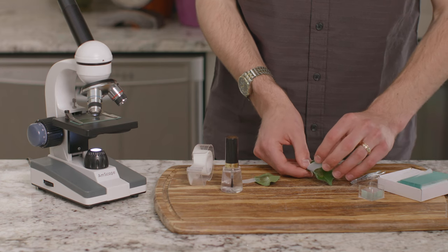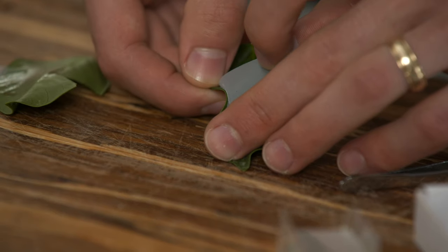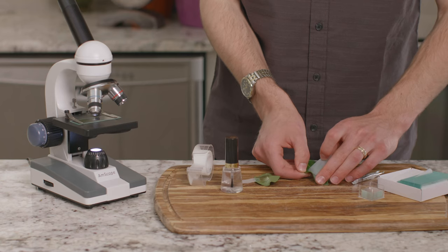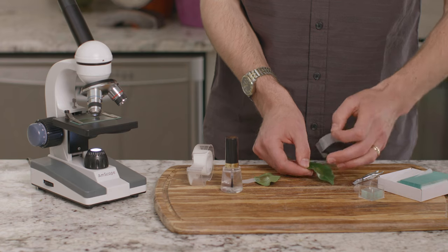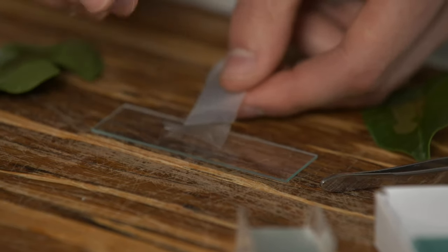Once the nail polish is completely dry, gently pull off the tape on the top of the leaf so that it pulls the nail polish off. Then, gently remove the tape so that only the dried nail polish is left, and carefully place it on the microscope slide.